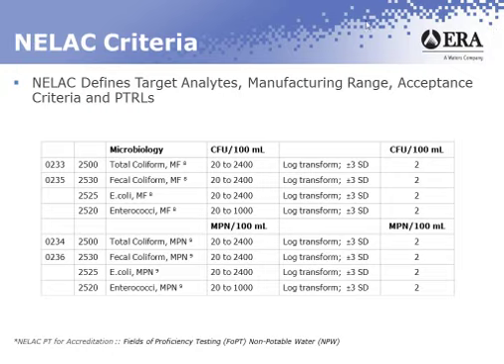All right, the NELAC criteria. The National Environmental Laboratory Accreditation Conference, sometimes referred to as the NELAC Institute, they define the required target analytes, manufacturing ranges, acceptance criteria, and PTRLs that are used by all approved PT providers to design their samples and evaluate the results. These are all communicated to the PT providers via what we refer to as fields of proficiency testing tables.